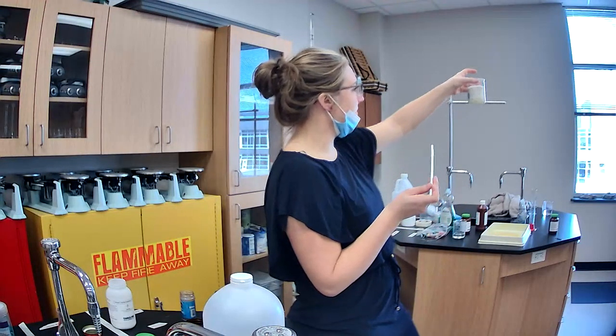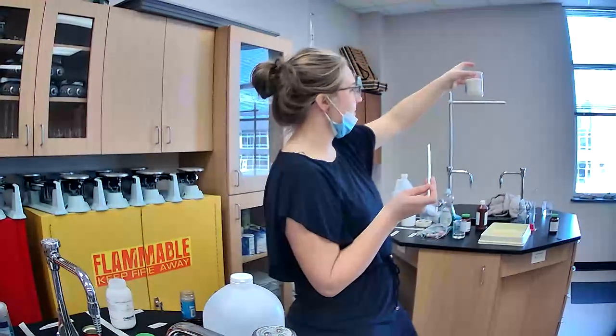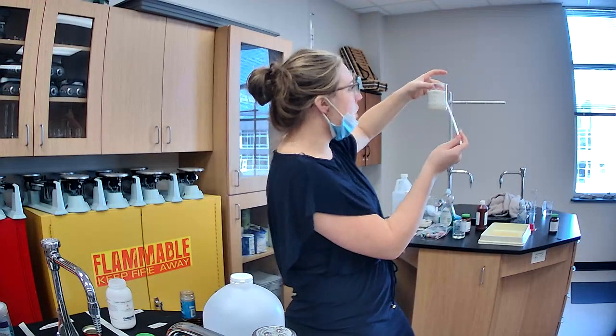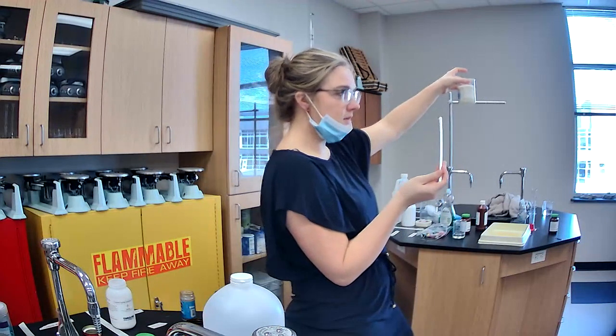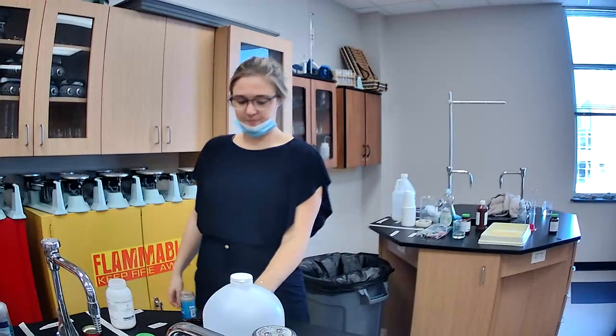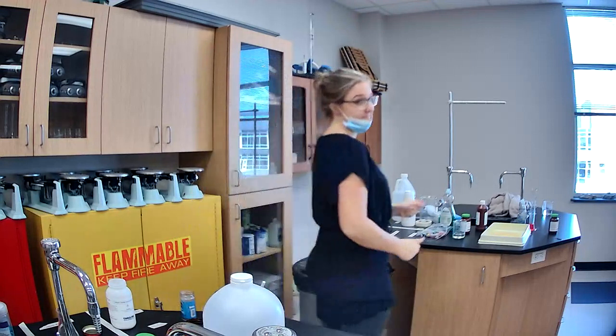See, look at it now. You see the foam growing? Okay, so the yeast is still reacting, creating more and more bubbles. I'm going to let it sit, and we'll come back to it in a little bit to see if it grows at all.